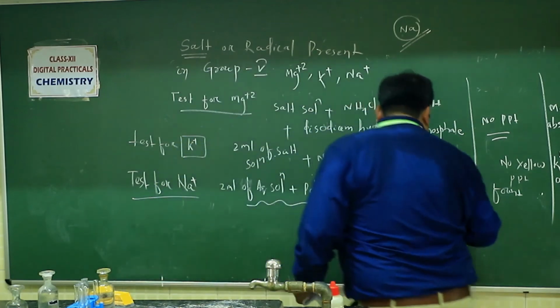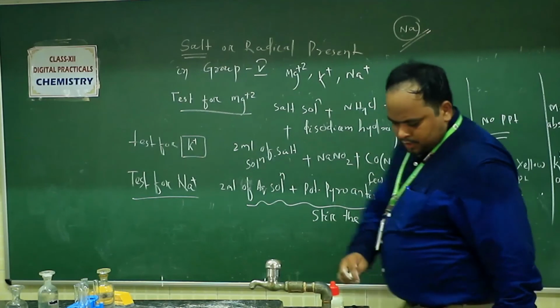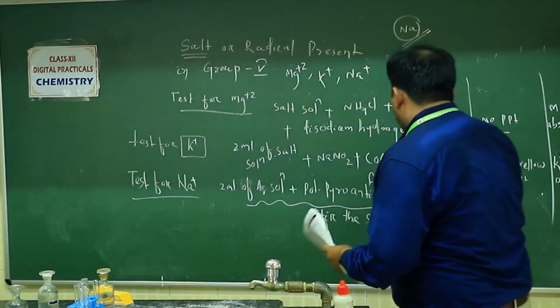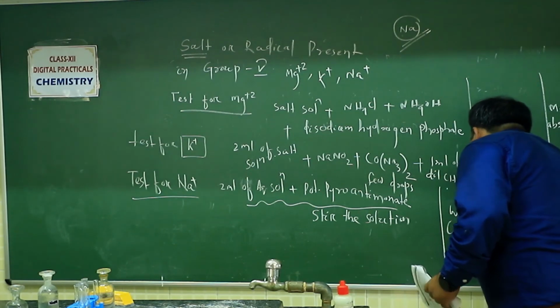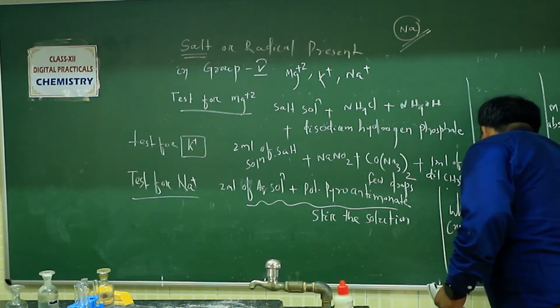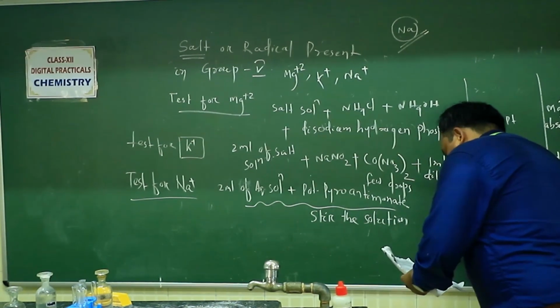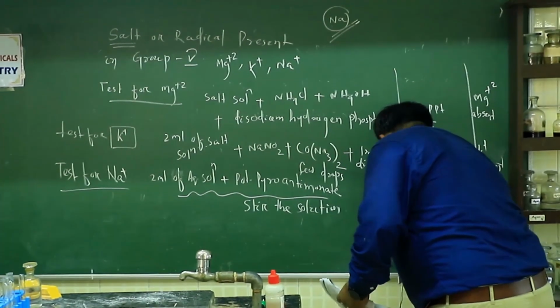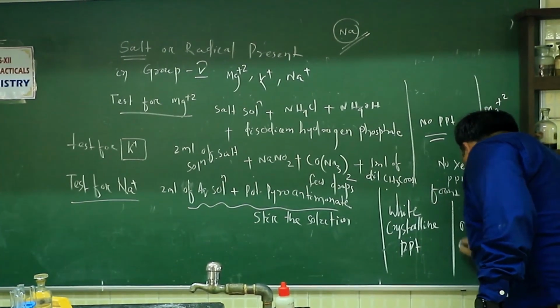What will you get? You will get a white crystalline solid, meaning precipitate. That means Na plus confirmed.